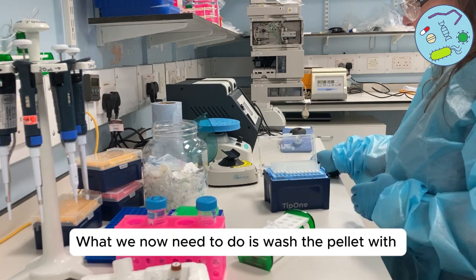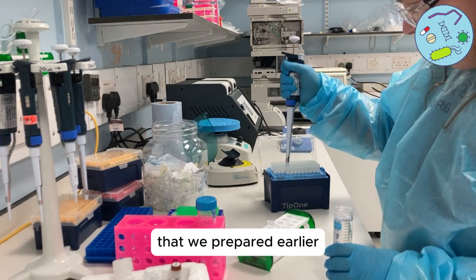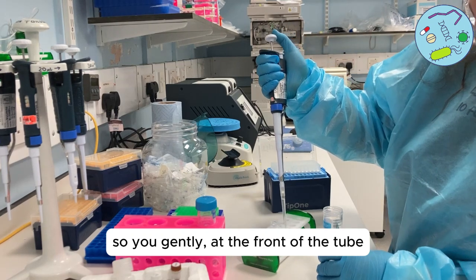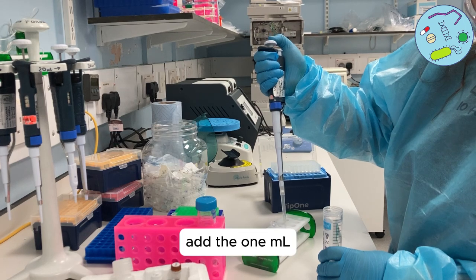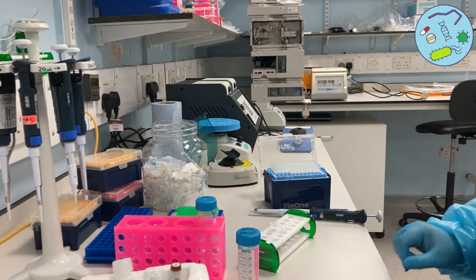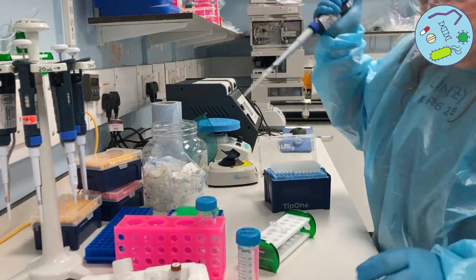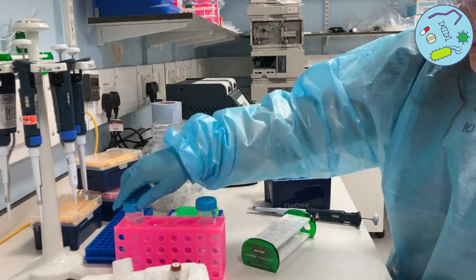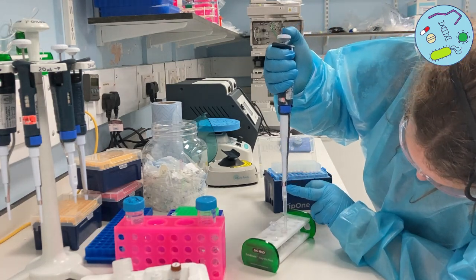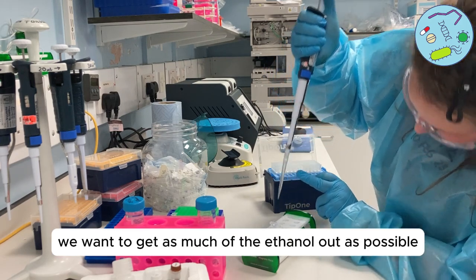We now need to wash the pellet with one milliliter of ethanol that we prepared earlier. Gently put the pipette at the front of the tube, away from the magnetic beads, and add the one milliliter. Leave it for around 30 seconds, and then we're going to remove that ethanol and do the same again.